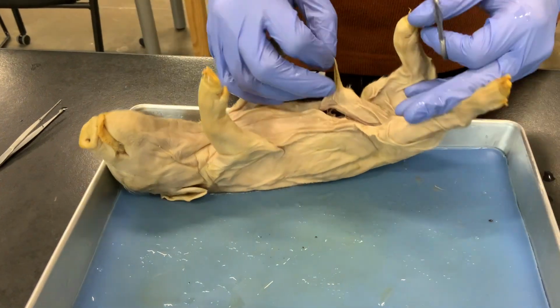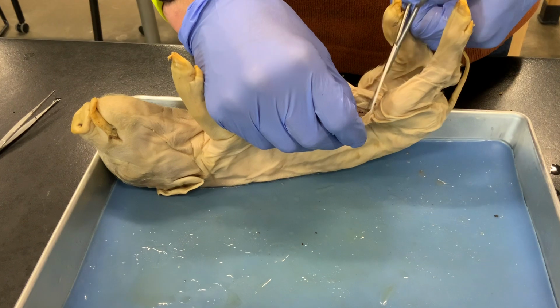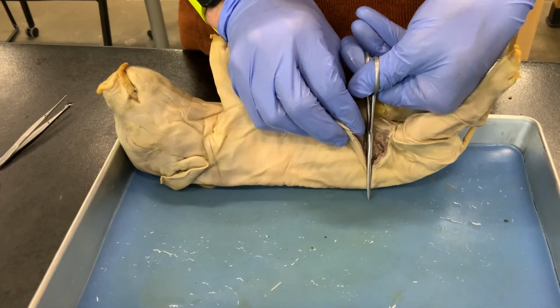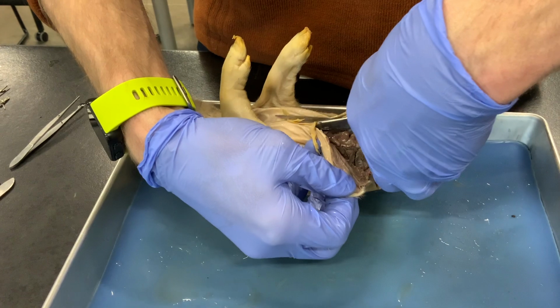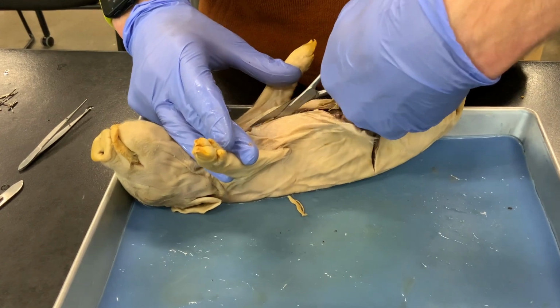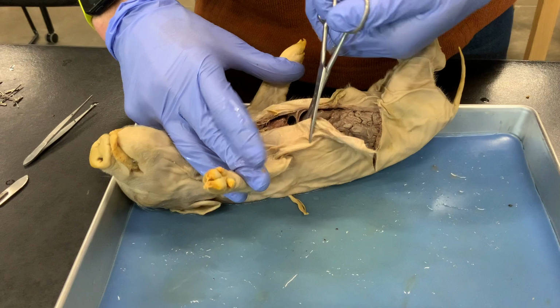And then again, once you can get into the body cavity so that we don't cut the internal organs, I use scissors to open the body cavity all the way back to the dorsal side, and up to the front of the rib cage, at the very front end of the thoracic cavity.